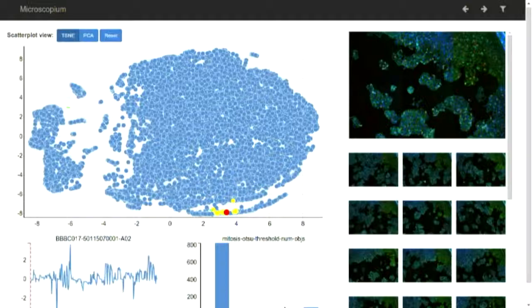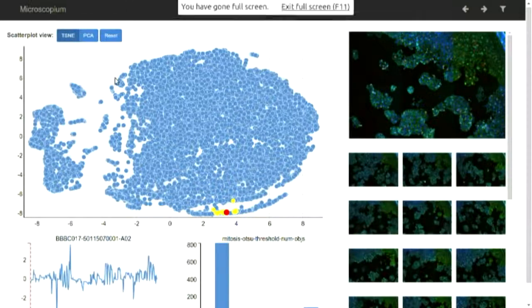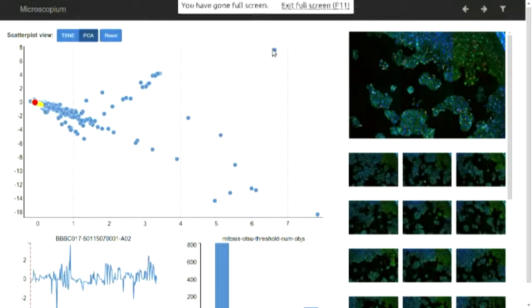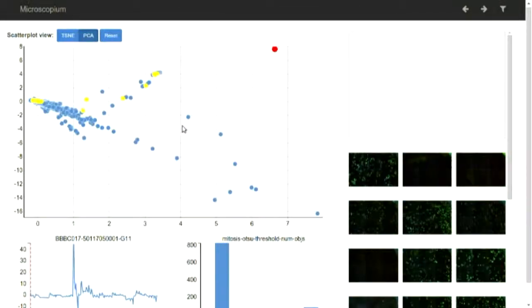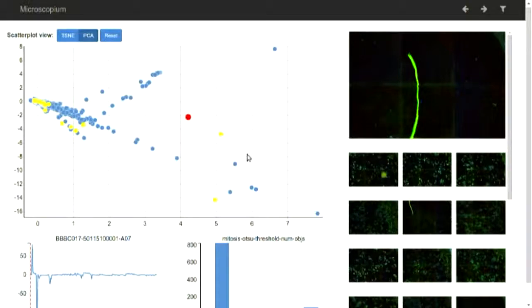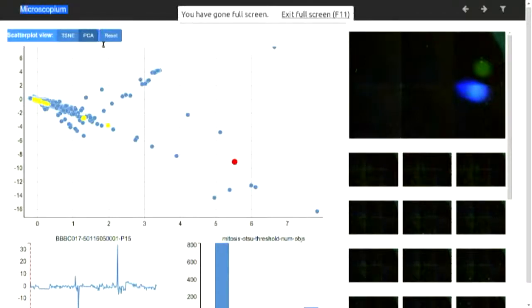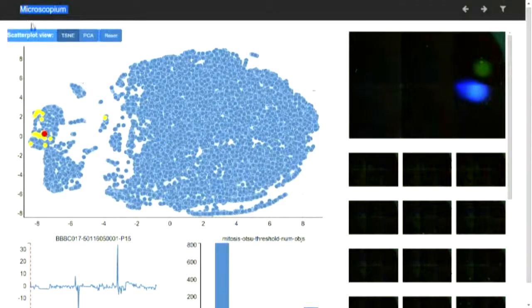1,000 different genes were stopped from expressing in order to determine what effect it actually had on the cell. In Microscopium, I can either look at my images using the principal component analysis view or the t-SNE view. What I was saying before with principal components analysis is it gets completely blown out by outliers, which is good and bad because it's quite good at detecting outliers, which is often caused by something like a piece of hair or a piece of fluff getting into the camera. But it's not that great for wanting to explore the data set, which is what's cool about t-SNE.